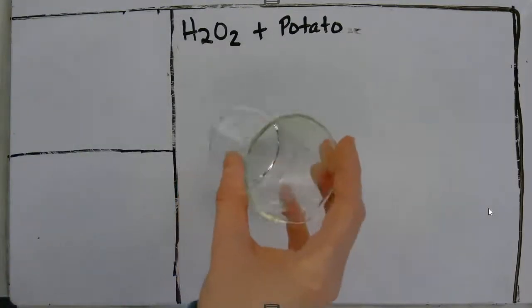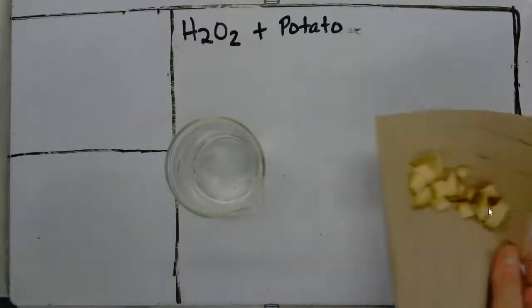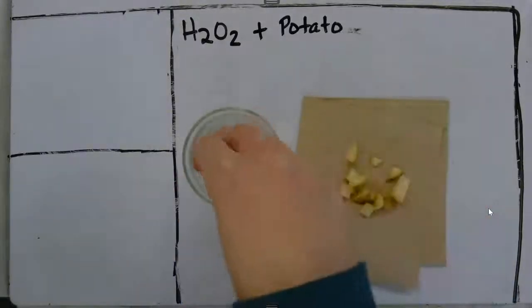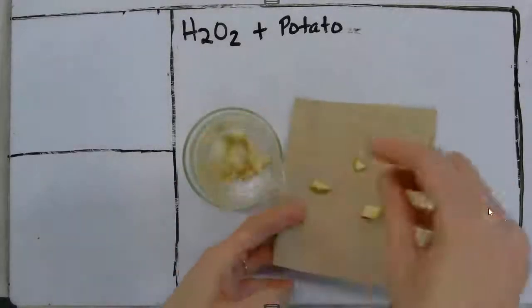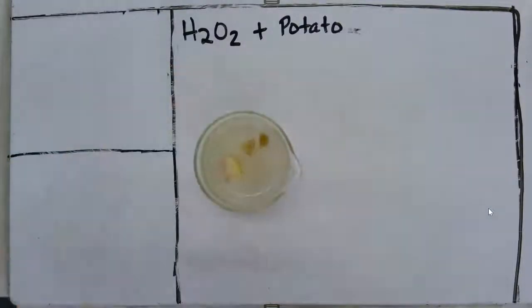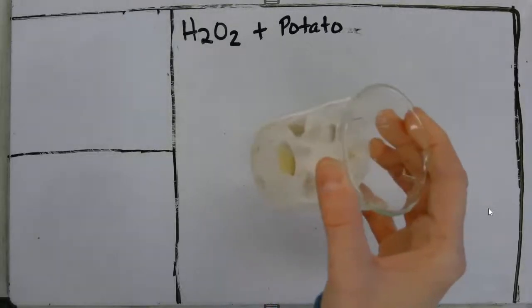We're going to take hydrogen peroxide, which I have in this beaker, and add pieces of potato to the hydrogen peroxide. You can see that it's starting to bubble with the formation of a gas.